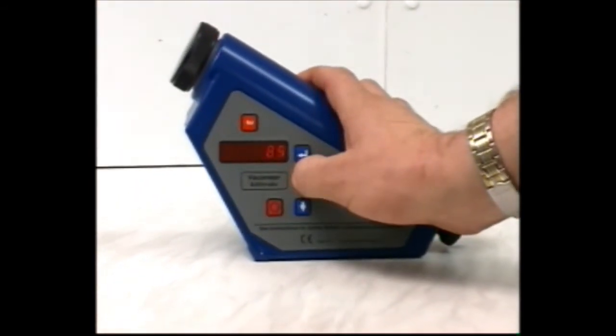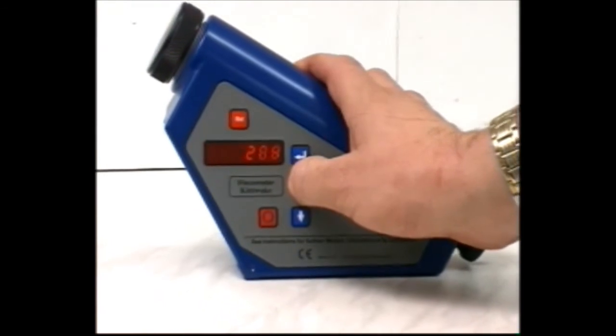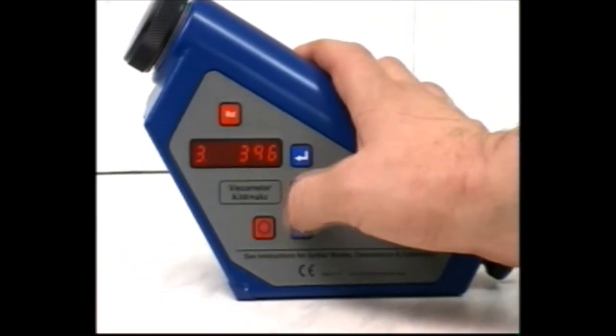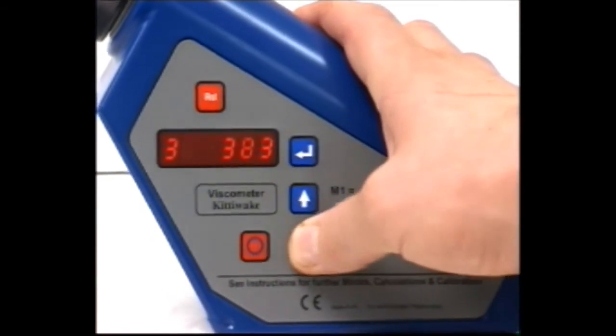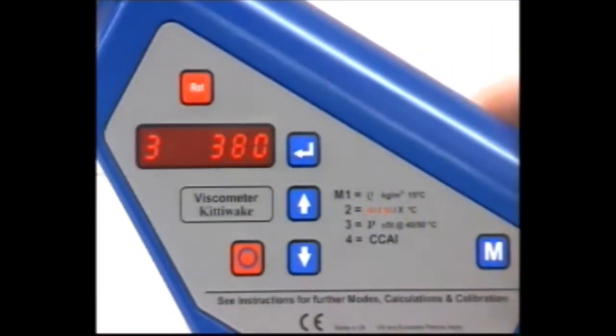In mode 3, display the last recorded viscosity. This can be altered using the speed and arrow keys. Go to mode 4 to display the CCAI.